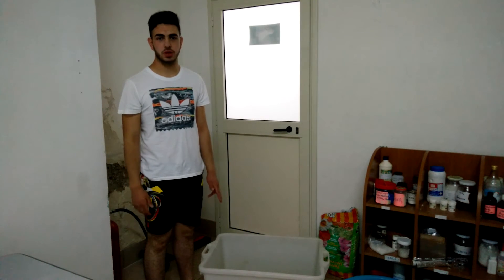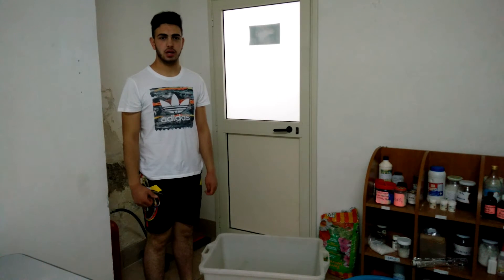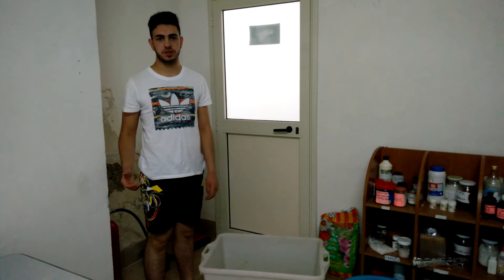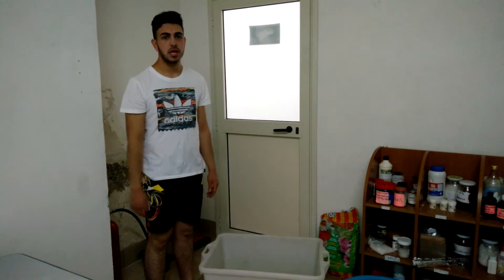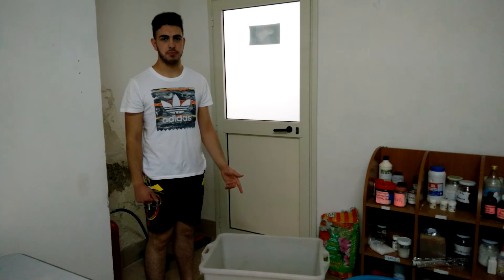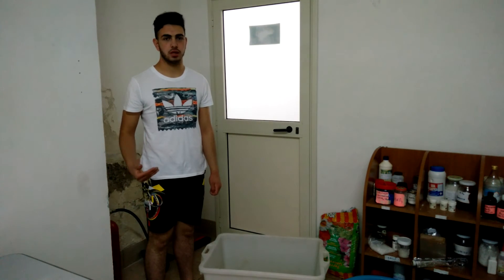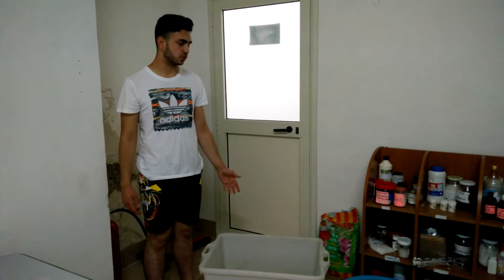It's important to clean our lab equipment. If we don't have something that produces water directly, we have to take some wash bottles, such as these two ones, and we have to put some water into them in order to wash our equipment in a fast way. So we have these two things to wash.